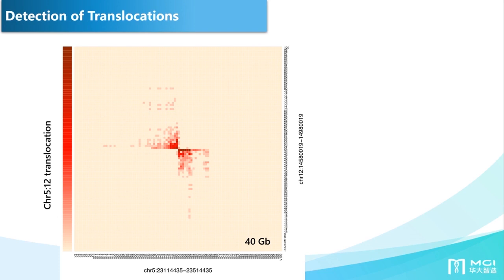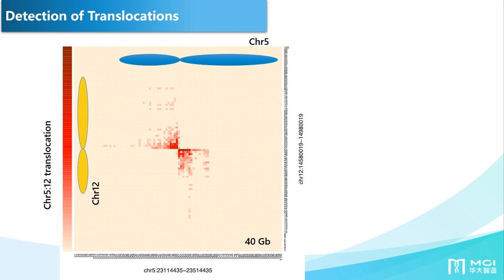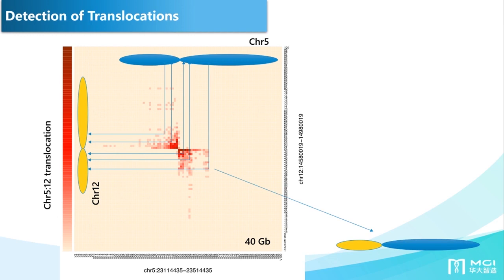We can also apply this for detecting translocations. In this case, for chromosome 12 and 5, we observed again in the red regions in the middle, they are sharing a lot of the same barcodes. Two different chromosomes should never share the same barcodes because they should be very far away from each other. So generally when we see this, that's indicative of a translocation. In this case, the entire arms on these two chromosomes were translocated.